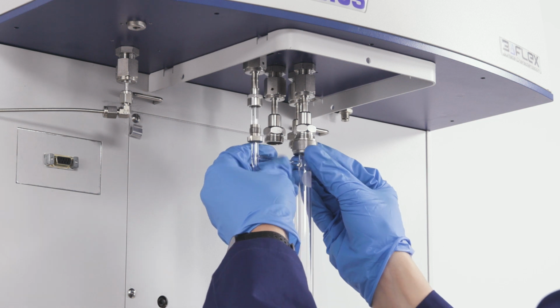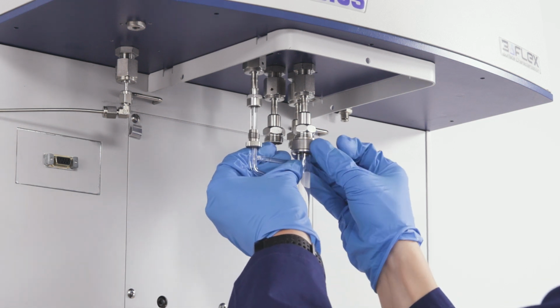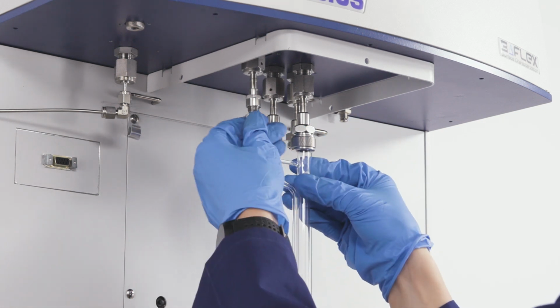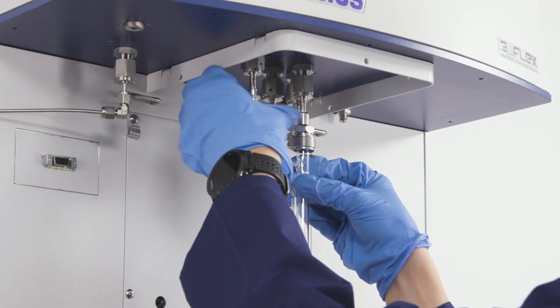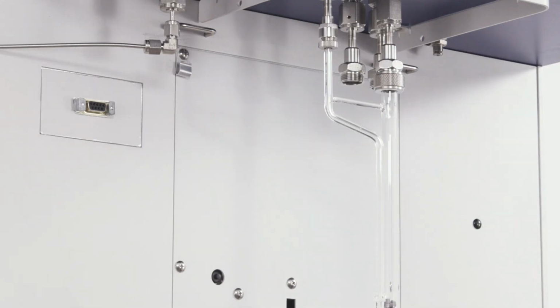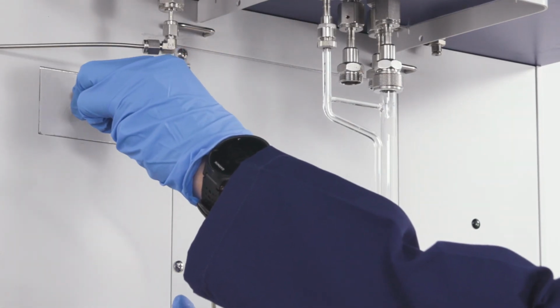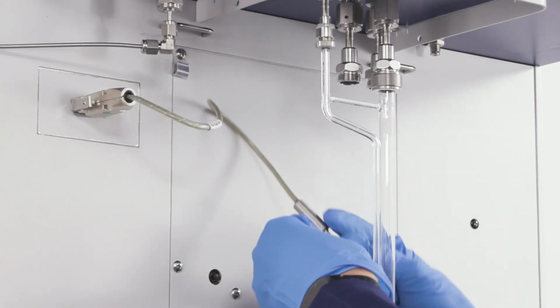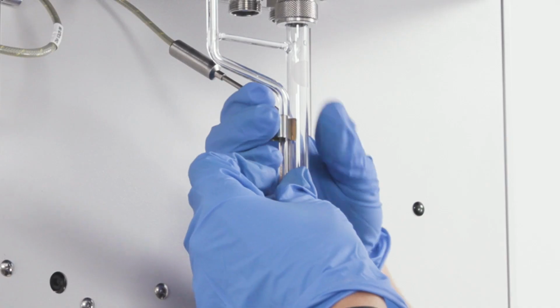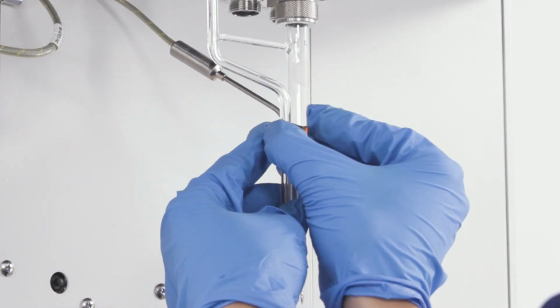Next, take the sample tube to the instrument and screw in the sample and exhaust ports. Take a thermocouple and attach it to the instrument. The temperature probe on the thermocouple sits on a ledge on the sample tube. Use a clip to secure it in place.